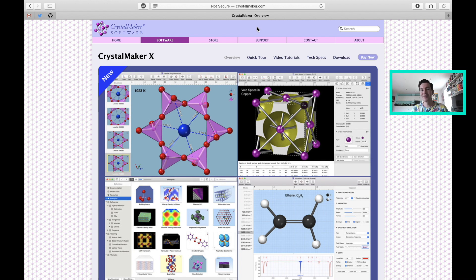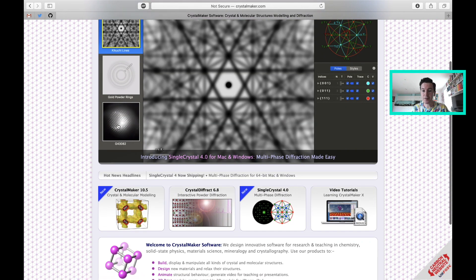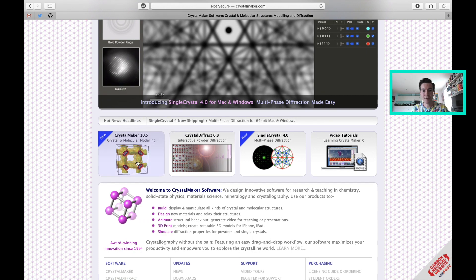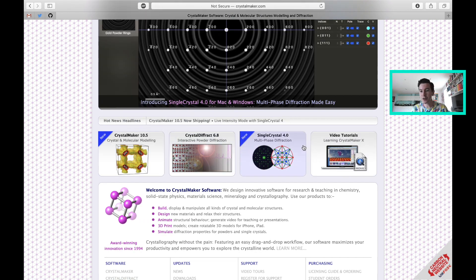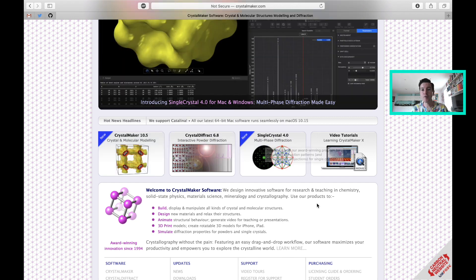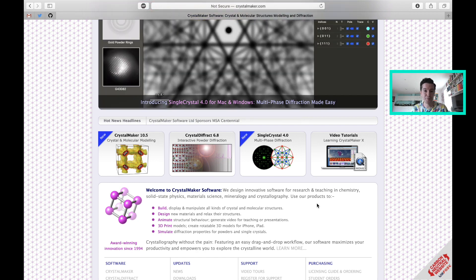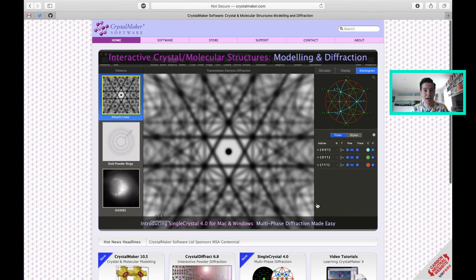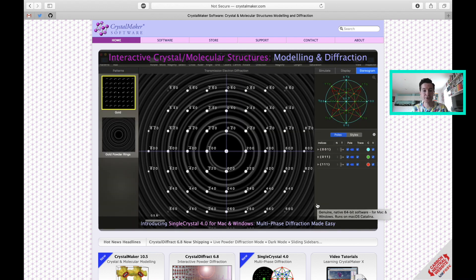It's really fast and it can produce some really sophisticated visualizations. The company develops three pieces of software: CrystalMaker, CrystalDiffract, and SingleCrystal. The first is related to the visualization side, and the other two are related to refining crystal structures from measurements. Our department actually pays for a site license covering all three packages.